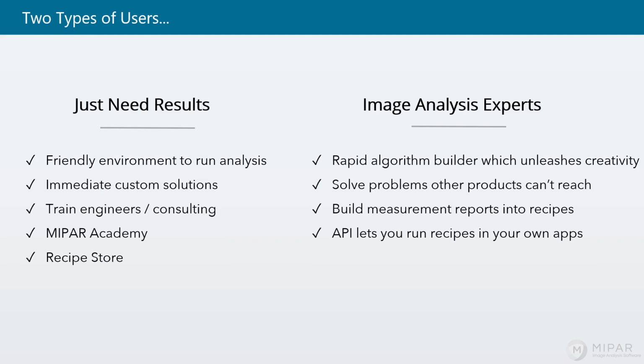And if needed, our team and our online help material can train your team in software operation and consult as projects grow and evolve. If you have an interest in becoming more experienced in image analysis algorithm building, we encourage you to check out our MIPAR Academy, which is a self-paced Udemy course, completely free, that will walk you through the fundamentals of image analysis and how those can be applied in an environment like MIPAR to address real-world image analysis problems.